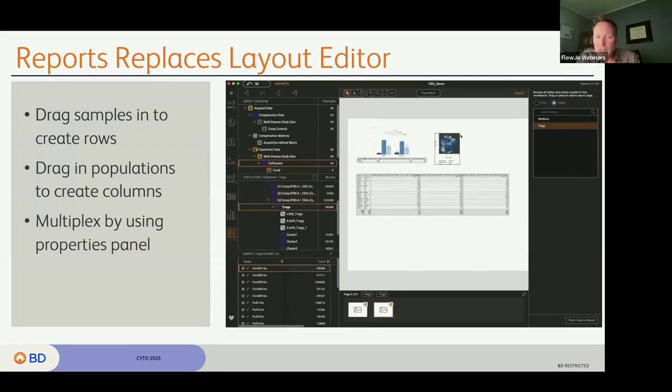And then you can also set that page to not batch. So you can build a multi-page report that has particular pages that are more like summaries, not batch, and then the rest that are going to show a common set of plots, all batch, so that you can control what you want. And you can control what you want in a variety of page sizes and formats and so forth.